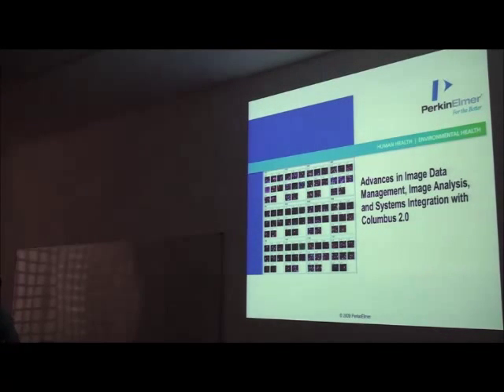How many objectives are on your Operetta? We have three, actually. We have 2x, 10x, 20x. And I actually also have the 40x with me. I'm disclosing this here so that you can test it and see. But technically they go from 2x to 100x. That's cool. And you can replace them easily.